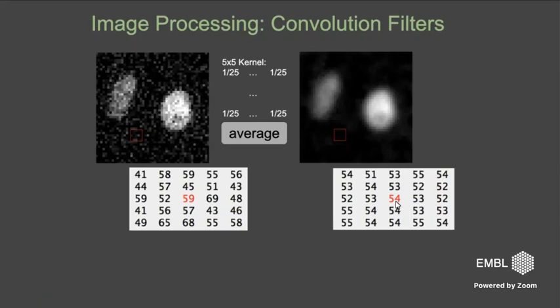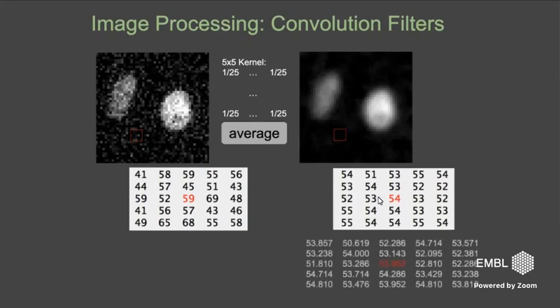One important detail here is that this is in fact wrong. What's here on the right is not the value that you get. What you really get are these values. That depends on what data type you choose for your image output. If it's just like the input image, an integer image, like you might have gotten it from the microscope, it cannot represent all these floating point values. So depending on whether you care about all these decimal points or not, you have to change the data type of the image when doing these filters. These are choices that you typically have to make and shouldn't forget.